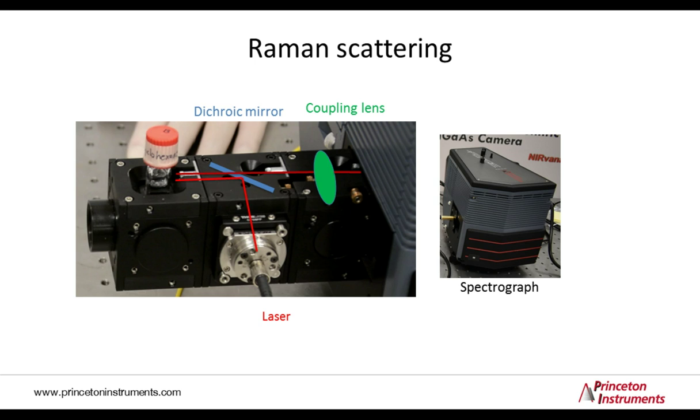And so here is what one might observe. These are Raman spectra of different substances. Oh, I'm sorry, I forgot to switch the slides. So cyclohexane on the top, sulfur in the middle, and ibuprofen on the bottom. There might be some contamination in the ibuprofen.